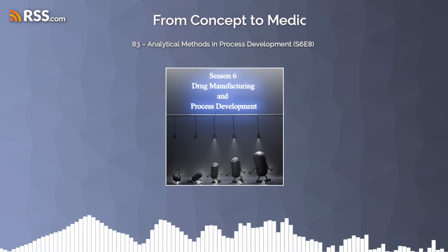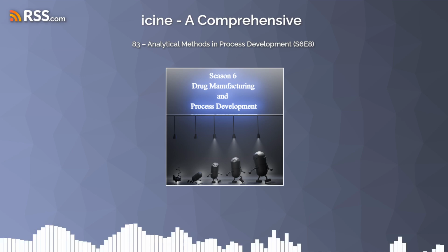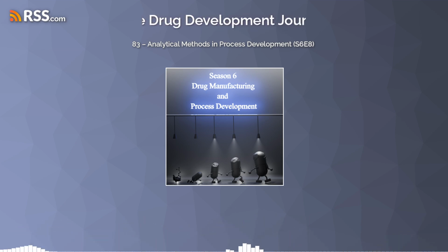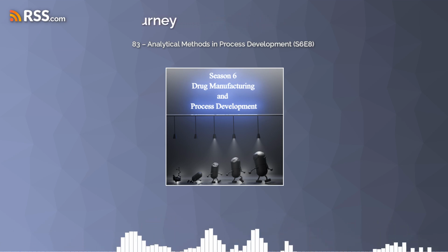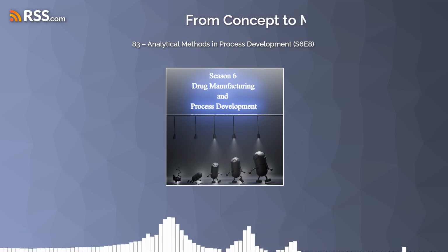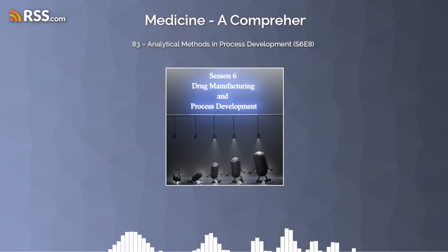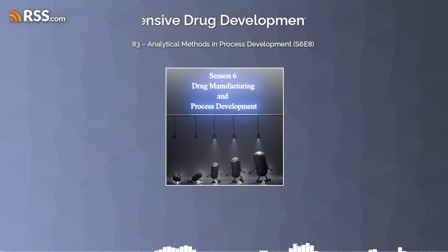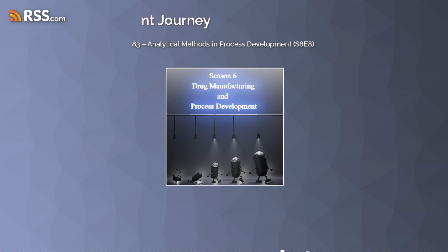I saw something that really caught my eye in the material. Continuous flow benchtop NMR. Now that sounds like a game changer. It is a really exciting development. What is it? So traditional batch reactions happen in flasks or in large reactors, kind of like a big pot. Right. But continuous flow chemistry involves running the reactions in a continuous stream through these small channels. And this offers a bunch of advantages. Like what? Well, you have much better control over the reaction conditions. Okay. You can mix things much more quickly and efficiently.